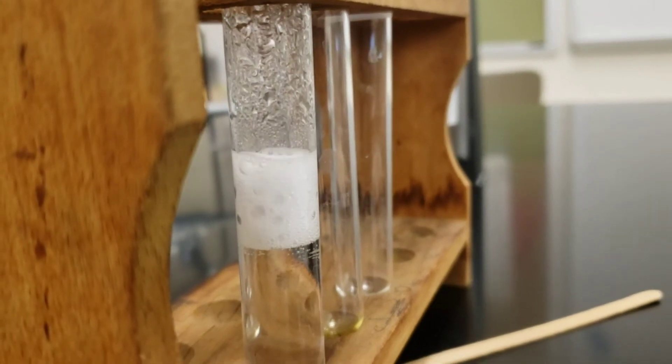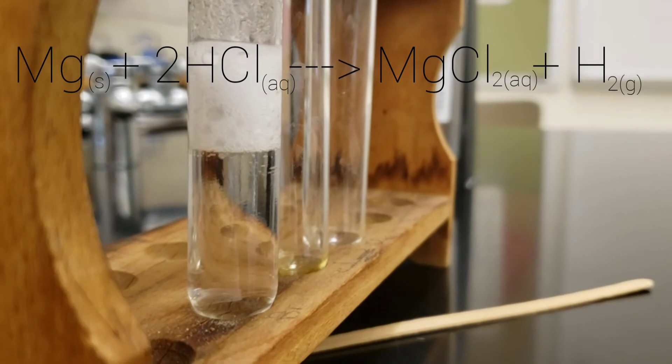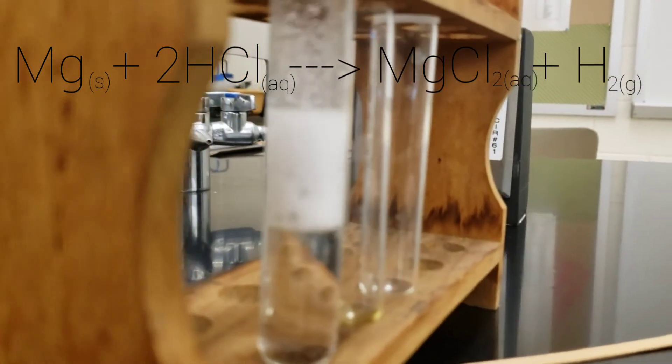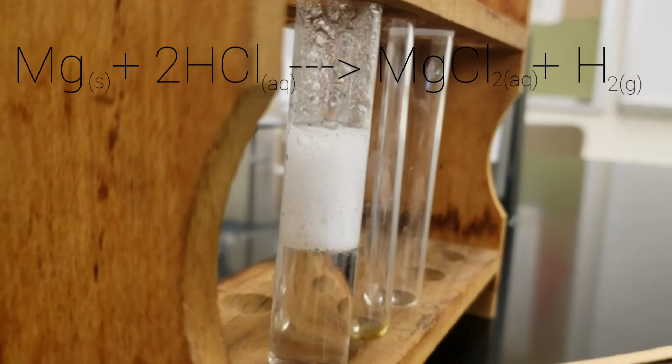Now I'll briefly explain the reaction taking place here. The reaction, which is up on screen right now, is a single replacement reaction in which one molecule of solid magnesium reacts with two molecules of aqueous hydrochloric acid.